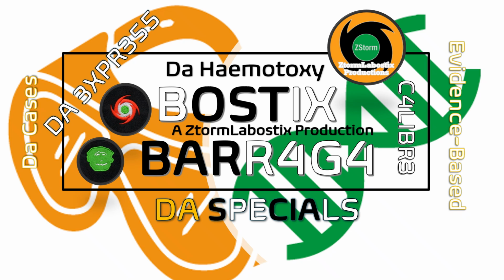Through this audio podcast, a look at some bases in identifying or determining tuberculosis with particular histopathological laboratory staining investigation. This work has been developed and drafted by science student Hussain at a particular academic institution in the United Kingdom.